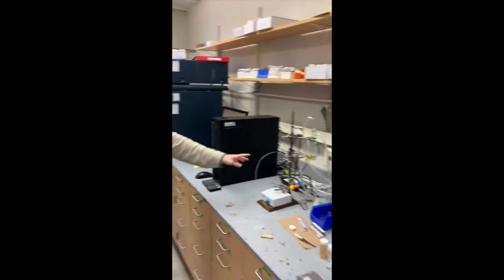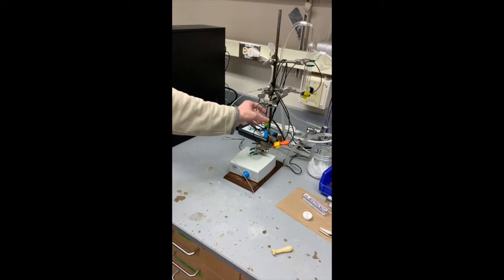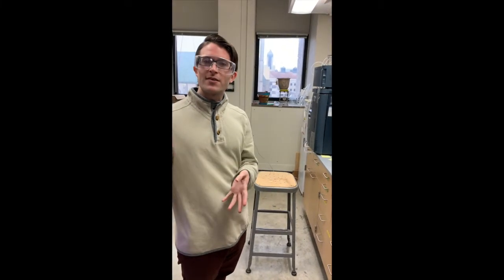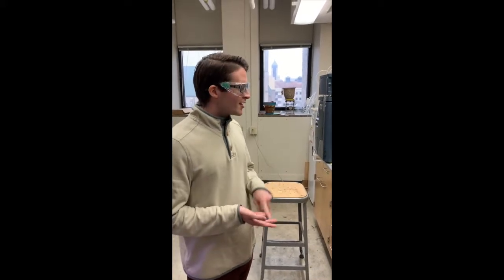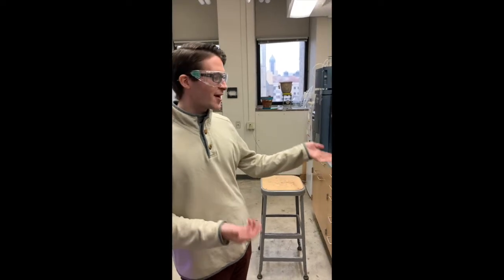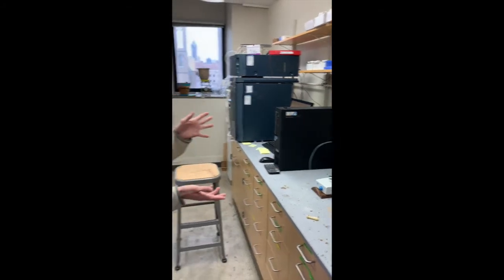But here, this small setup here is a potentiostat, so you can see kind of the little alligator clips that you would connect to different electrodes. And this is essential for everyone in the group to be running kind of some normal CV scans on either their photocatalysts or on substrates, but also Shane, one of our 4th year graduate students, is doing an electrochemical project. So a lot of his reaction setups are right here in this room using the potentiostat and the CV setup.